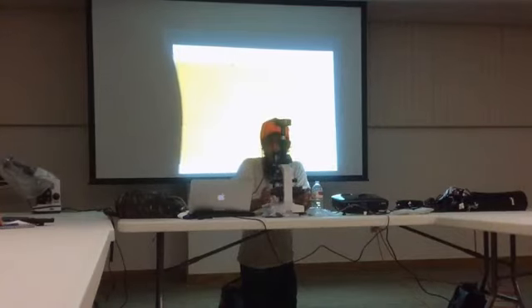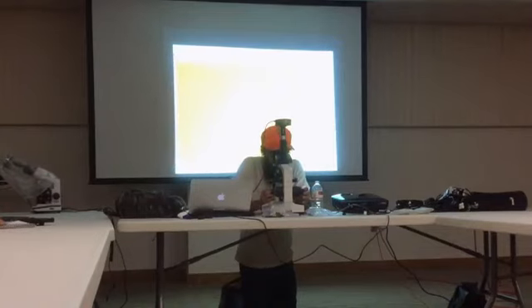A great way to wake them up is by adding worm tea, which has lots of humic acid in it, and it really wakes the fungus up and these guys up. So yeah, tons of spores. You see, it's just kind of covered with spores. I did see some interesting things.